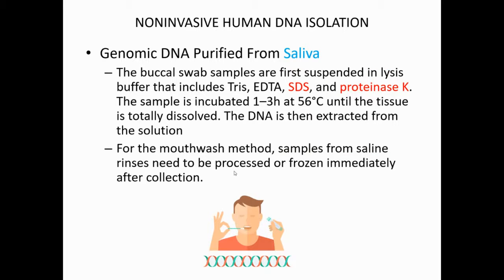And then from the saliva, you can have a buccal swab sample, and then suspend it in the lysis buffer. The lysis buffer has Tris-EDTA, SDS, and proteinase K. So these basically can break the protein. And then you incubate the sample at 56 degrees for 1 to 3 hours. And then you can extract the DNA from the solution. So that's the DNA collected from the saliva.